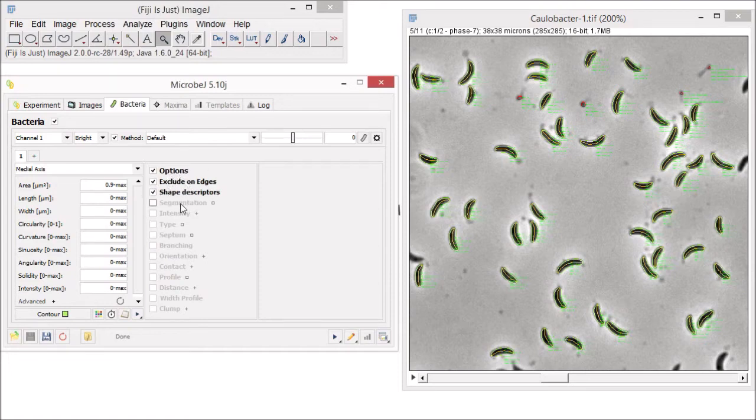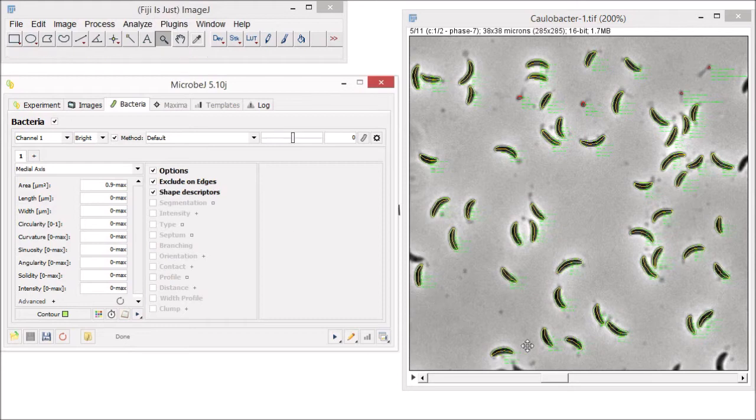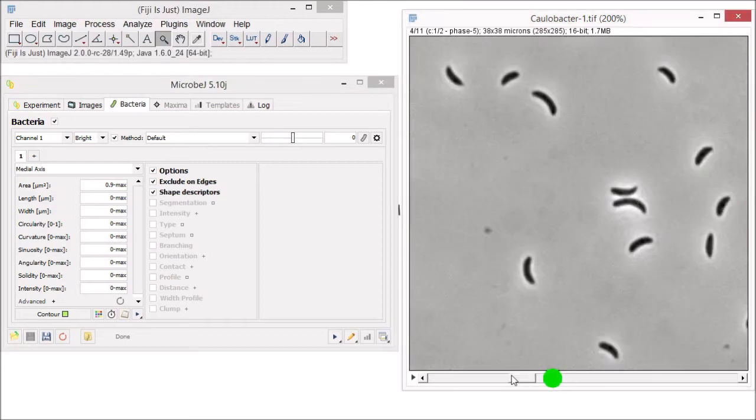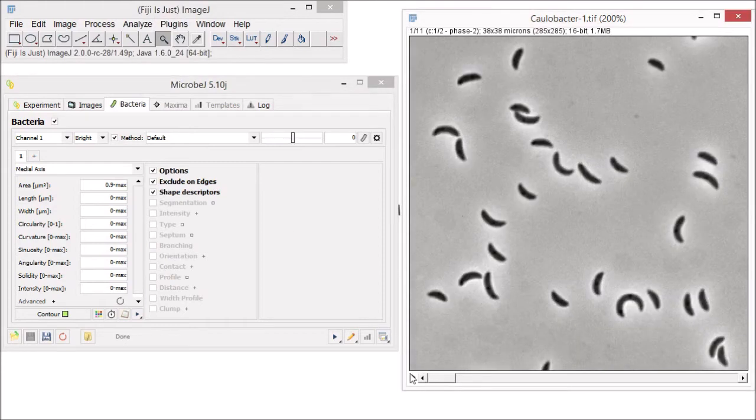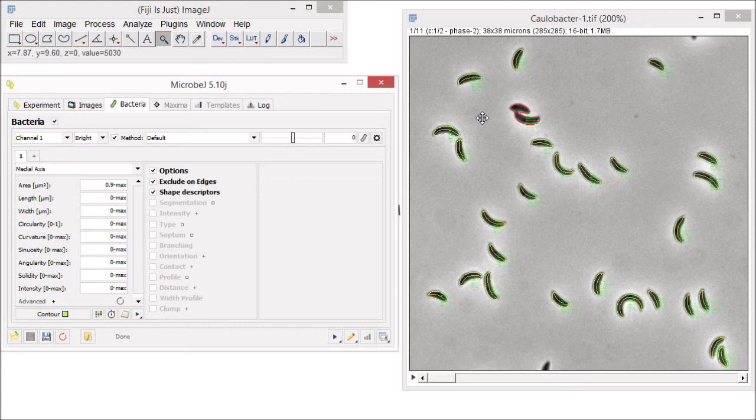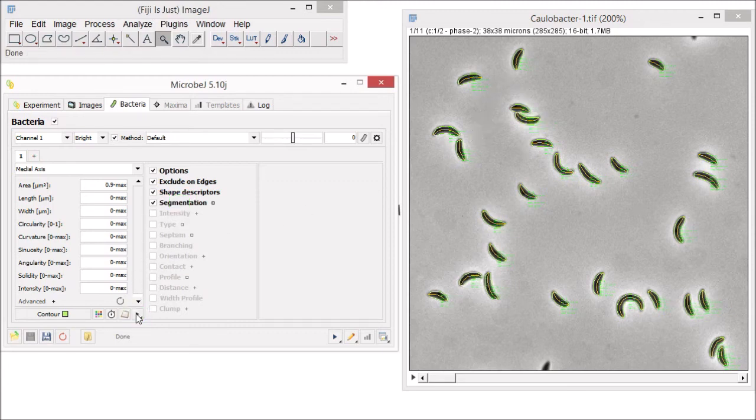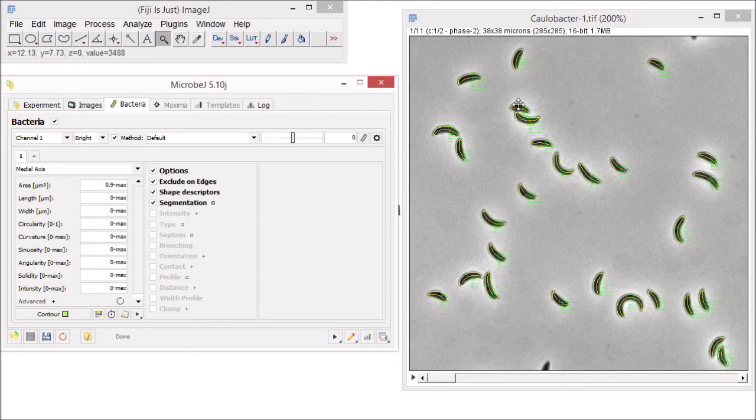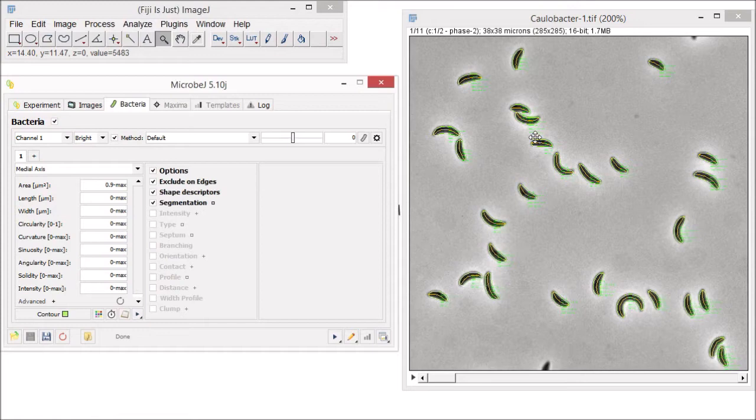Another option that is very useful is segmentation, which can be used to separate cells that are touching each other. Let's select that option now and go to the first slice in our stack of images and press test. You can now see that the two cells that were initially rejected from our analysis have now been segmented and will be included in our final analysis.